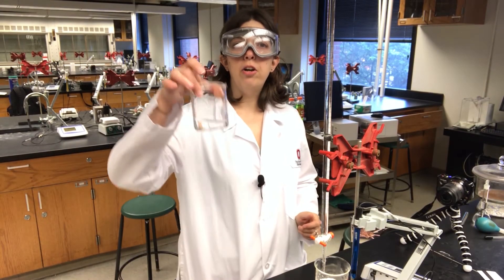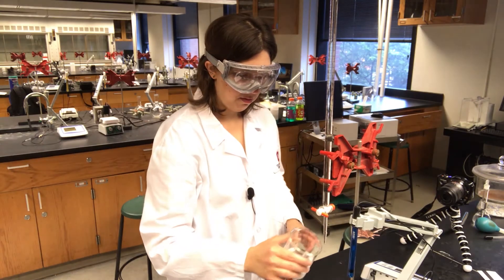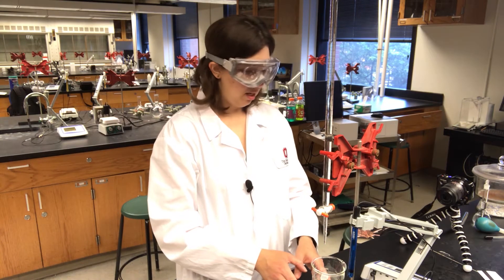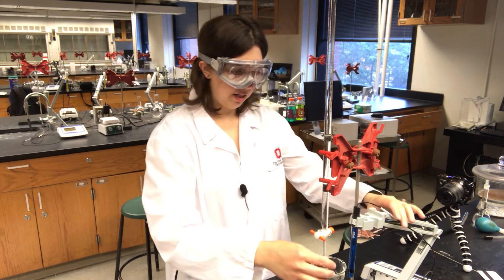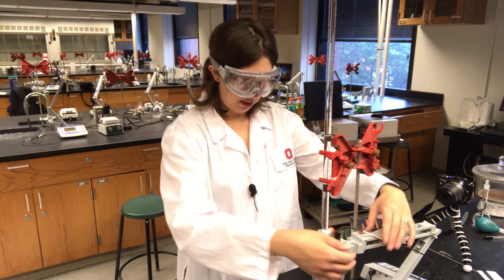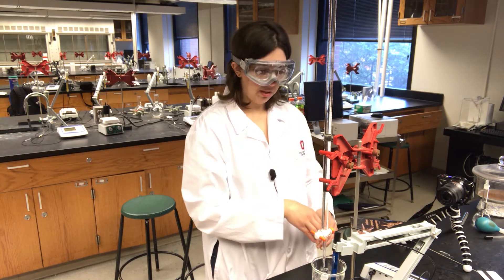My tartaric acid is now dissolved in water. My burette is filled with sodium hydroxide. I'm going to place my tartaric acid on a stir plate and lower the burette so that it's inside the beaker.